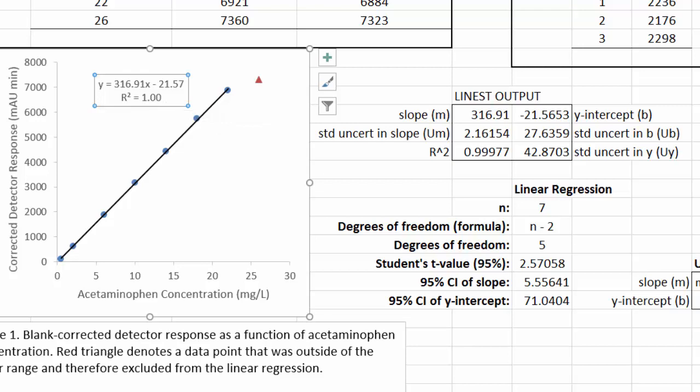And so I encourage you to set the number of decimal places so that the r² value does not get rounded to 1. So in this case, that would mean showing at least 4 decimal places to get it not to round to 1. This concludes this video.